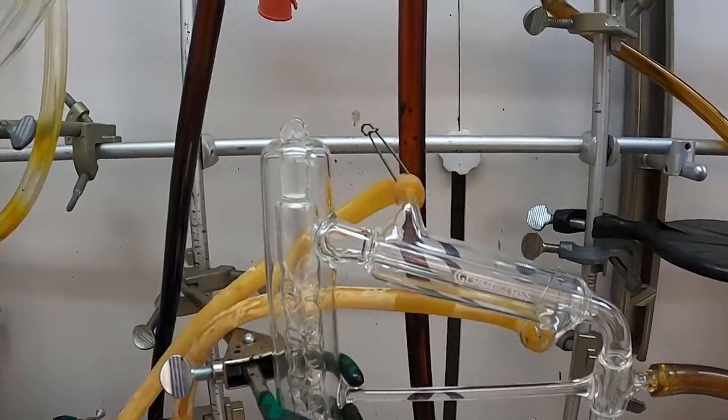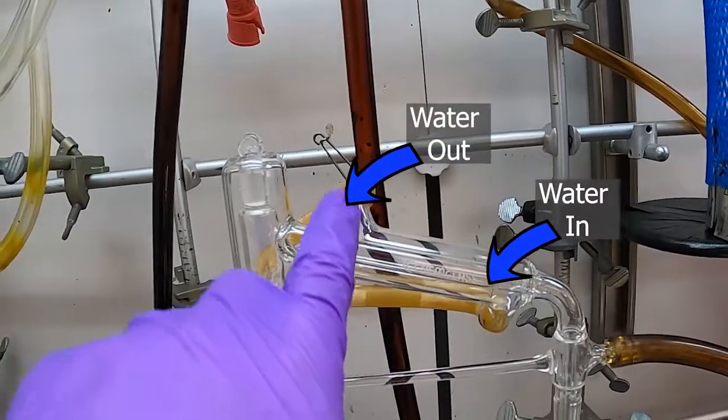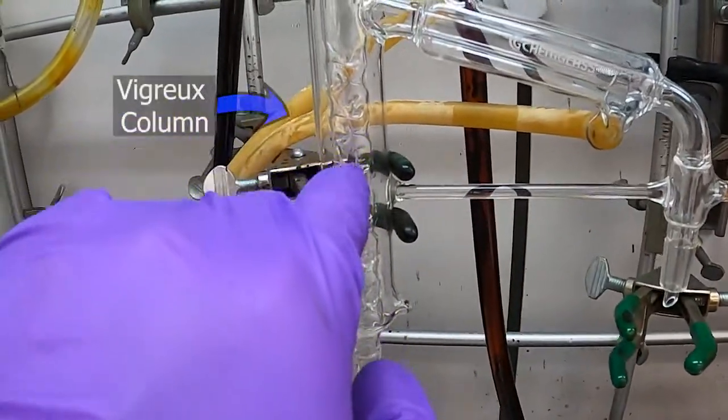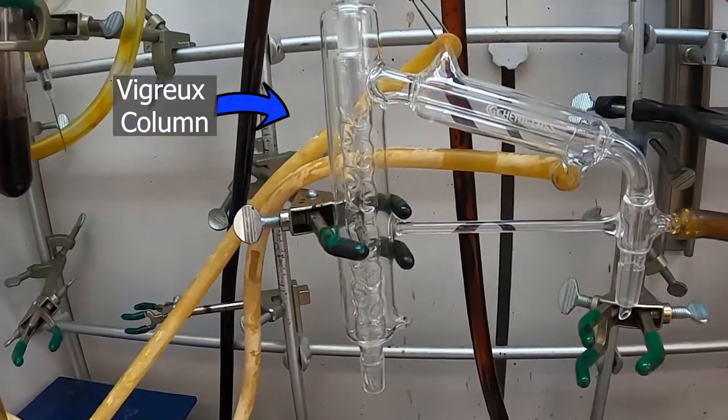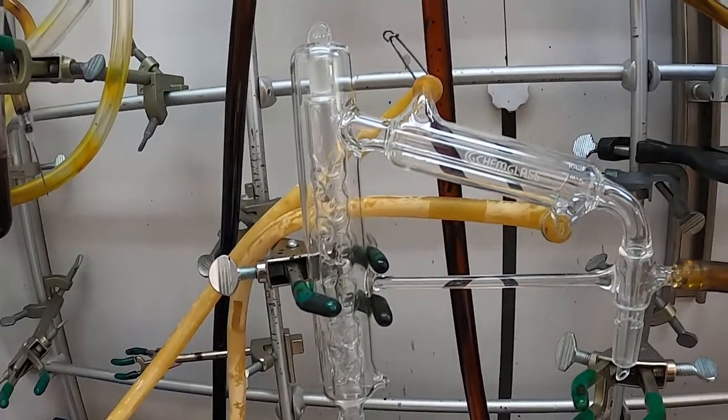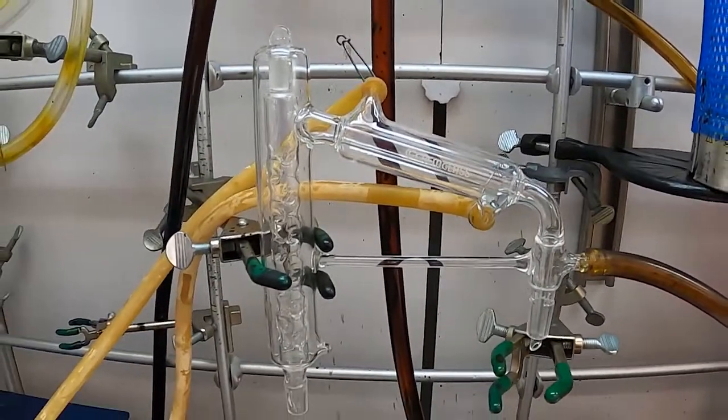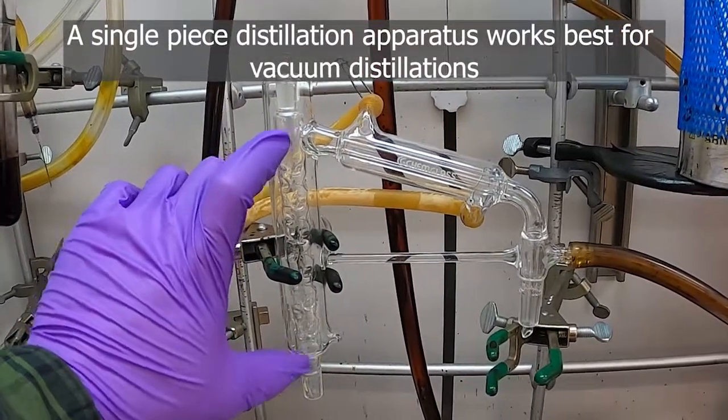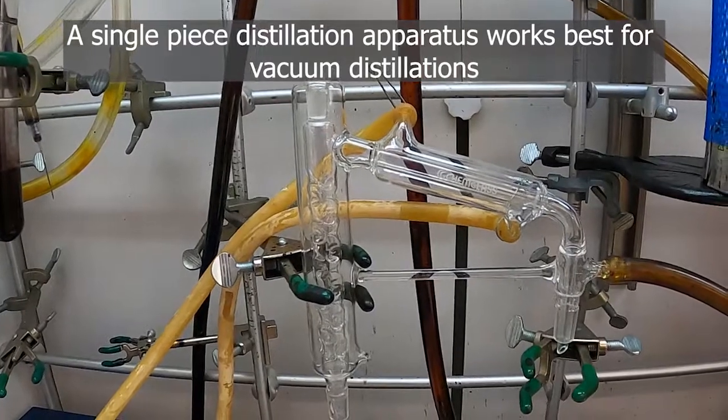I've got here already set up a kind of all-in-one distillation unit with a condenser portion where water can flow around it, as well as the actual column portion here. This one has the little fingers, so this would be called a Vigreux column, and you want to use a Vigreux column if you have compounds that are a bit more difficult to separate. There are other types—short path can be used for more volatile things. There's also separate pieces where you have a column and then an adapter piece and then a separate condenser. Those can also be used for distillations and are probably more frequently used.